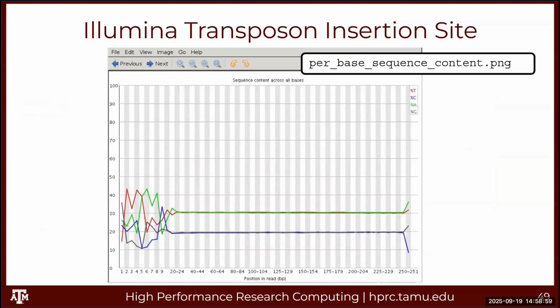It's part of the genome, but the genome assembler may ask you to trim that off because it might do something in the background that says I'm going to take the first part of the read and assume the rest is similar, and then go with that. So it may ask you to trim it, but you don't have to unless the tool tells you to trim it. But it is part of the genome.